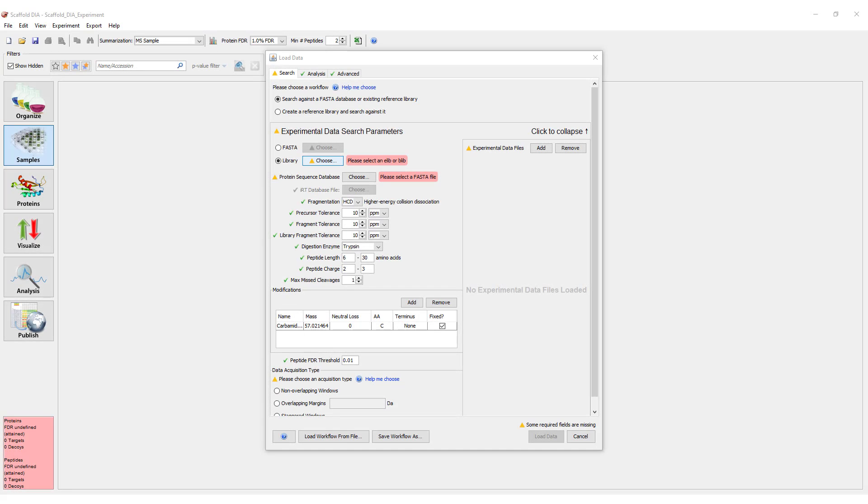Let's begin stepping through the process of loading data when using an existing library. Users who have configured DDA search engines, such as Mascot, should be familiar with the majority of the parameters that need to be set in order to start a search.